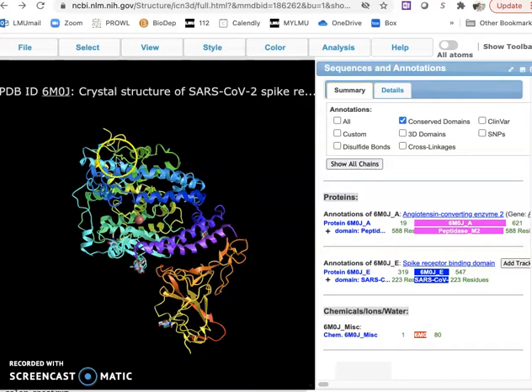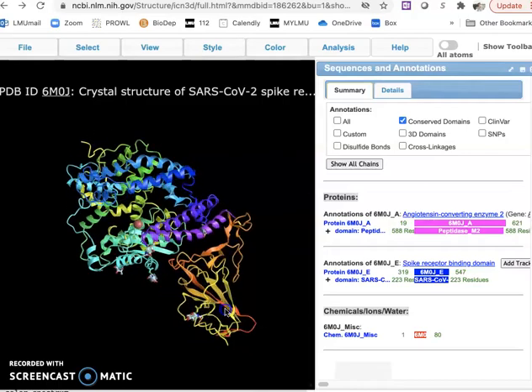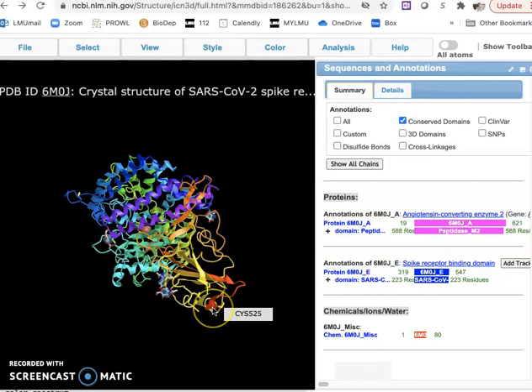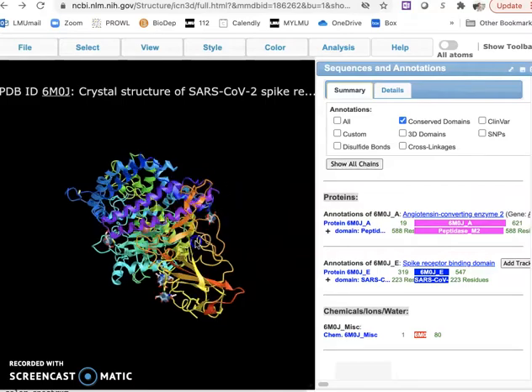You can follow it up to its C-terminal in yellow. Then the yellow color translates into the N-terminal of the spike protein and ends up on a red arrow here, which is the C-terminal of the spike protein.